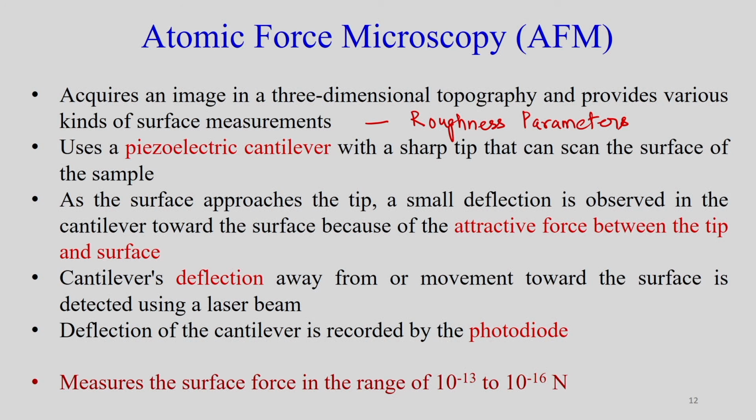And apart from the roughness parameter, it also measures the adhesion force. Now, how does it work? It uses a piezoelectric cantilever and its tip is attached to it, which scans the surface.